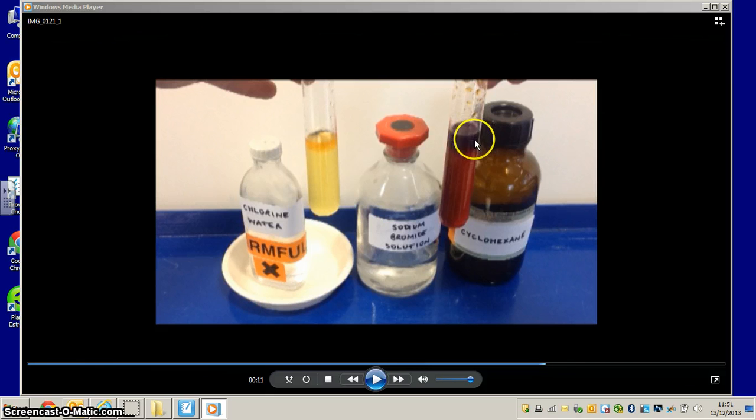If we keep shaking the tube, all this purple colour will eventually go into the organic solvent which is on the top, and likewise if we keep shaking this solution, all the orange colour will go into the organic layer on the top. So that's displacement reactions. It will not work the other way around.